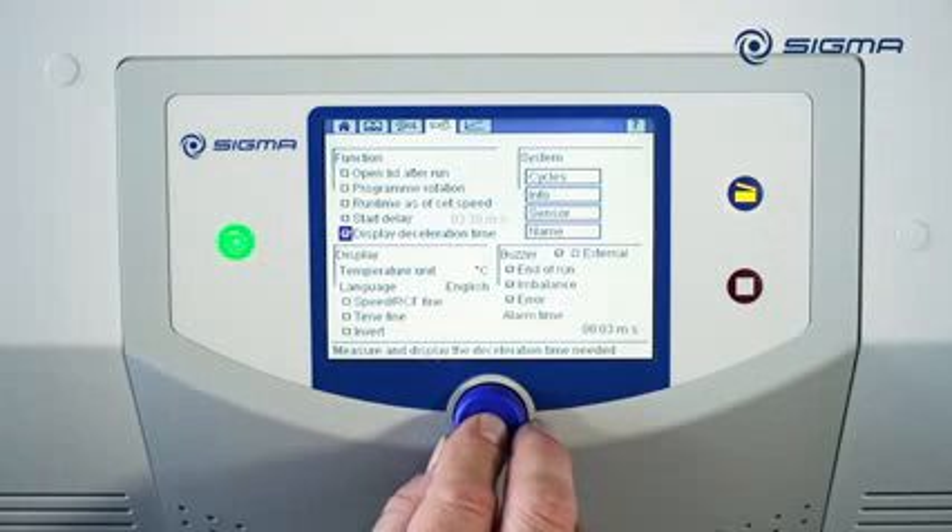If the Display Deceleration Time option is enabled, at the end of the run time, the centrifuge displays the time it needed to decelerate to a stop from the set point speed.